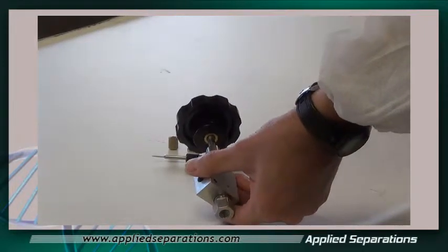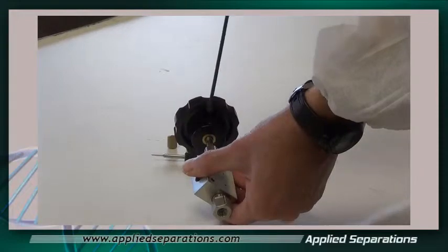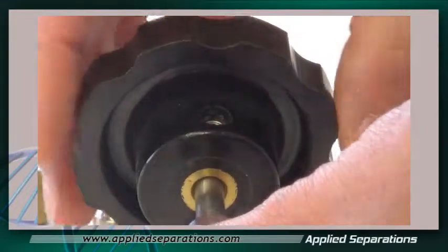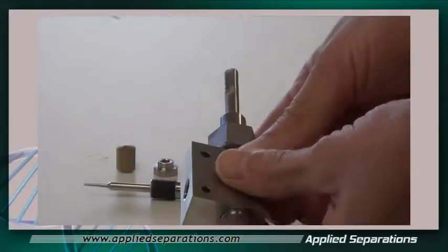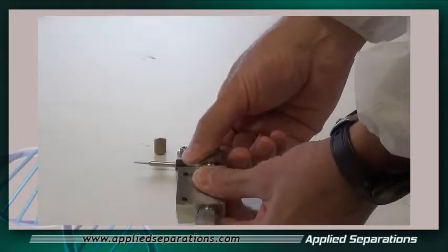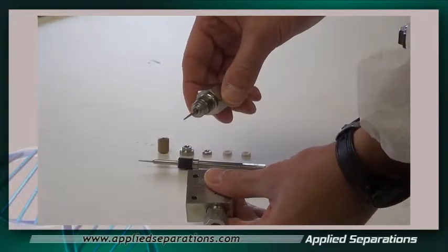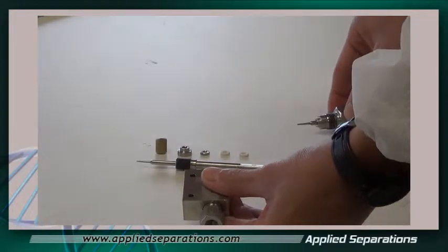Now we need to remove the handle by removing the set screw. Then we need to remove the large nut on the top — you're going to need a couple of wrenches — and that comes out. Set that aside for right now.